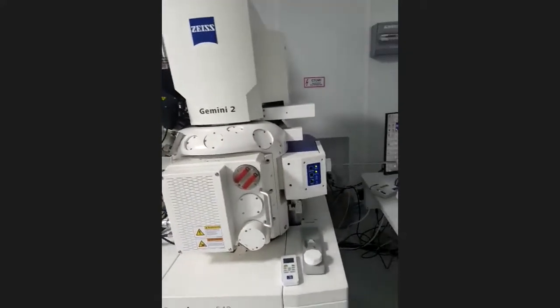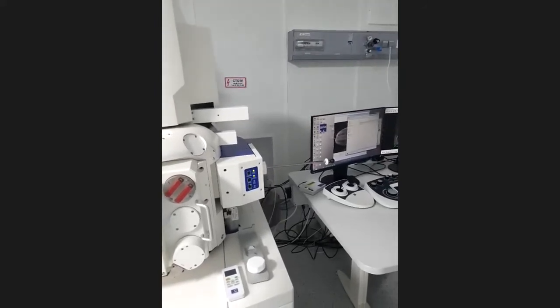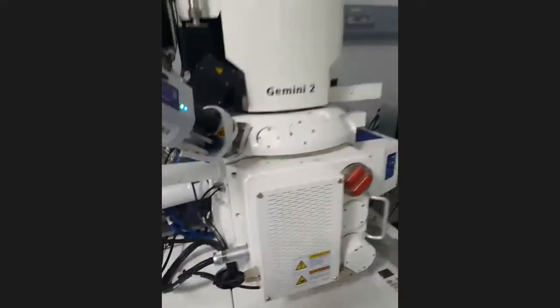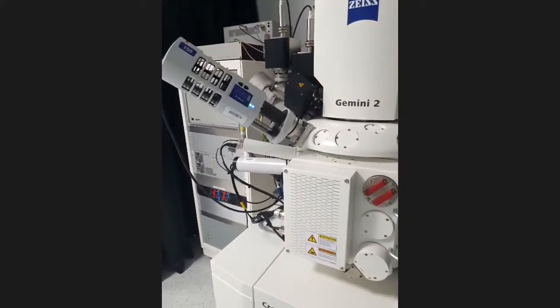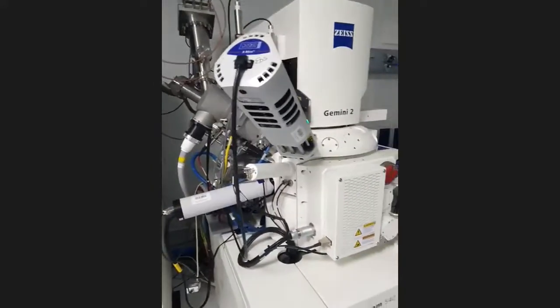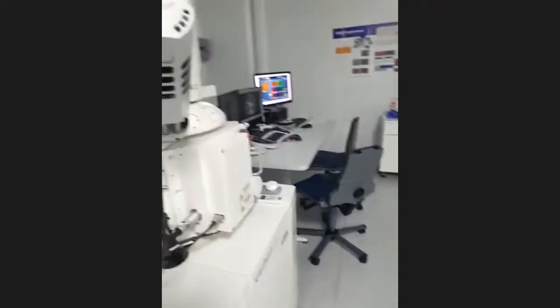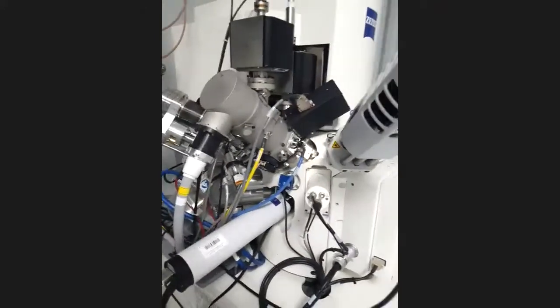make an electron image, and for example a chemical composition map, a structural map, layer by layer. This is the most powerful instrument of modern material science. This is a really powerful instrument, and you can cut a material science sample or a biological sample, it doesn't matter.